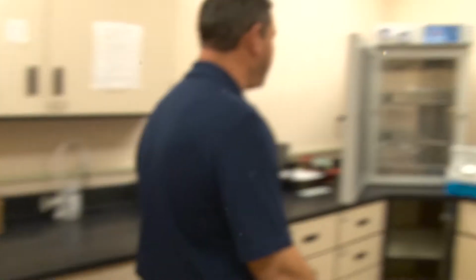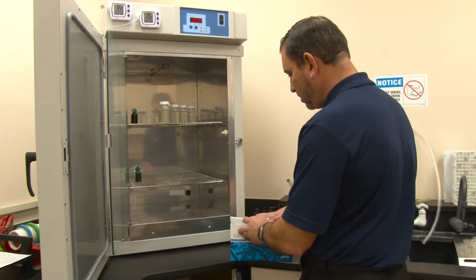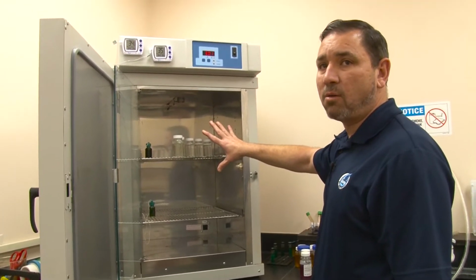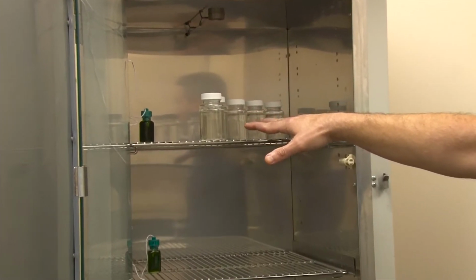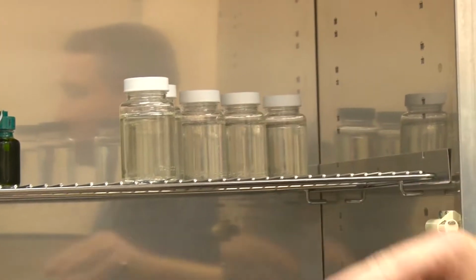But this is where it all happens, as far as the micro, to make sure the water is safe to drink. And like I say, once they put the sample in, this is an incubator. It has to stay in here for 24 hours. So tomorrow they'll come in here about 2:30 or 3, when they put these up today, and they'll make sure all these are still clear tomorrow. And if they are, then that means there's no Bac-T in the water.